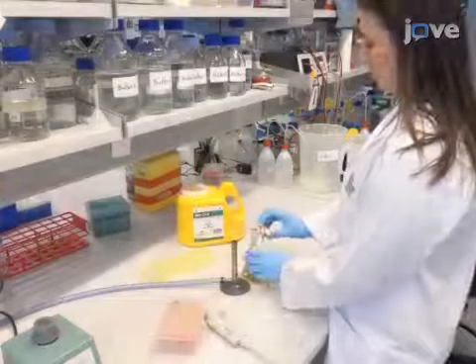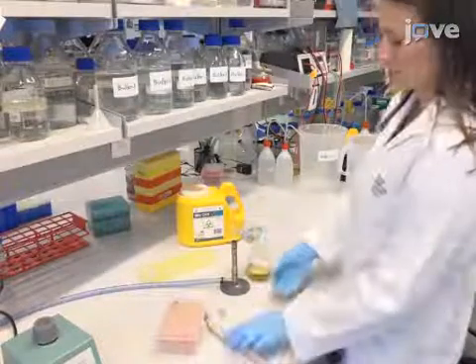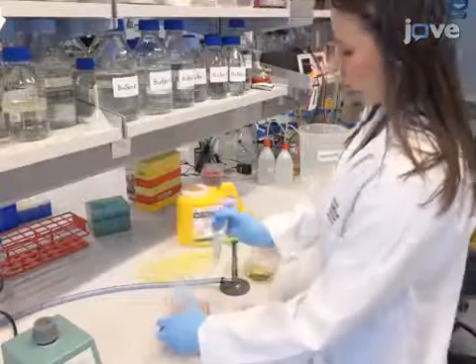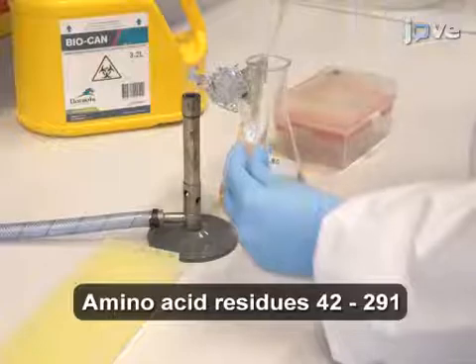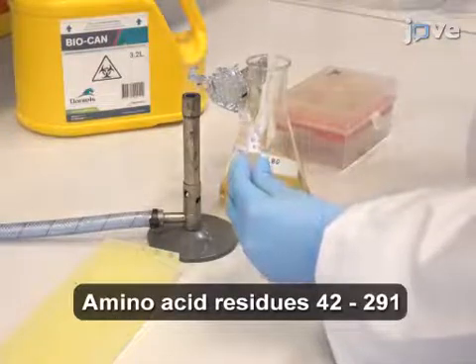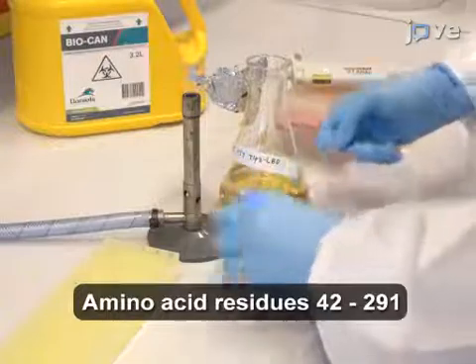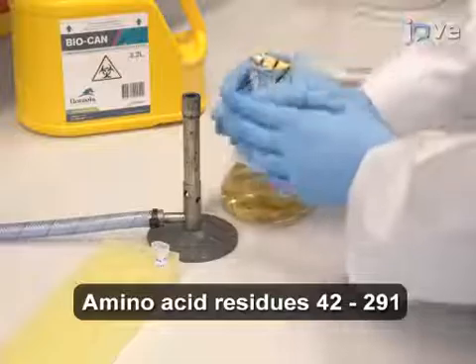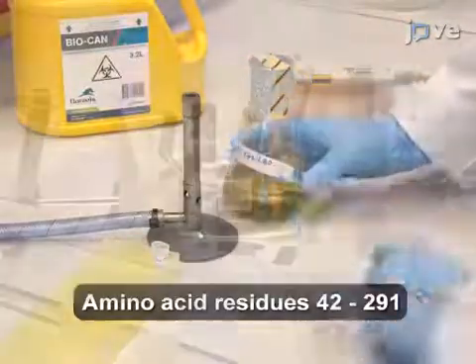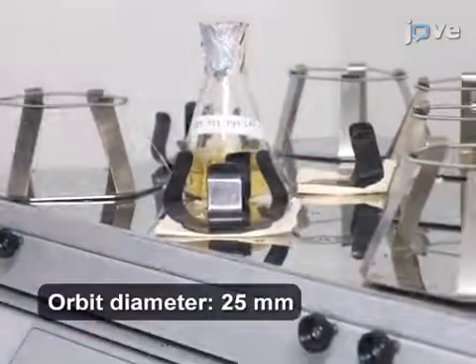To begin, inoculate 150 milliliters of sterile LB broth containing 50 micrograms per milliliter of ampicillin with BL21-COCON-PLUS DE3-RIPL cells transformed with the PET151-D-topo vector for expression of hexahistidine TIP3-LBD. Incubate the culture at 200 RPM and 37 degrees Celsius overnight.